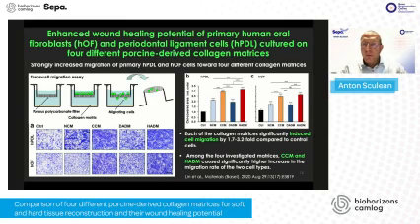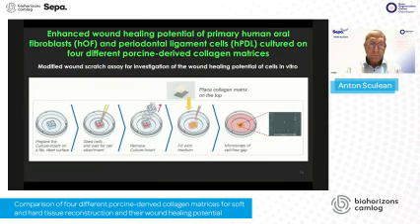And you see also the summary of this on the graphs. Please observe that the red and the orange graph perform quite well, and always a tendency of a higher performance of the dark red graph is visible. And then we wanted to see in a so-called wound scratch assay the wound healing potential of these cells.